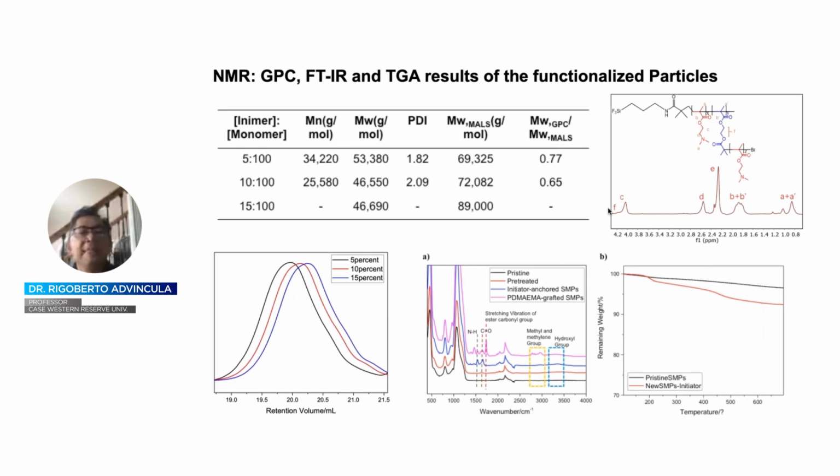That is, the more inimer we have, the higher the branching, but then the molecular weight, which can also be influenced by the hydrodynamic volume, does not easily track, but rather has to be distinguished by the use, let's say, of a quadruple detector that differentiates viscosity effect, refractive index effect, light scattering, and UV-Vis.